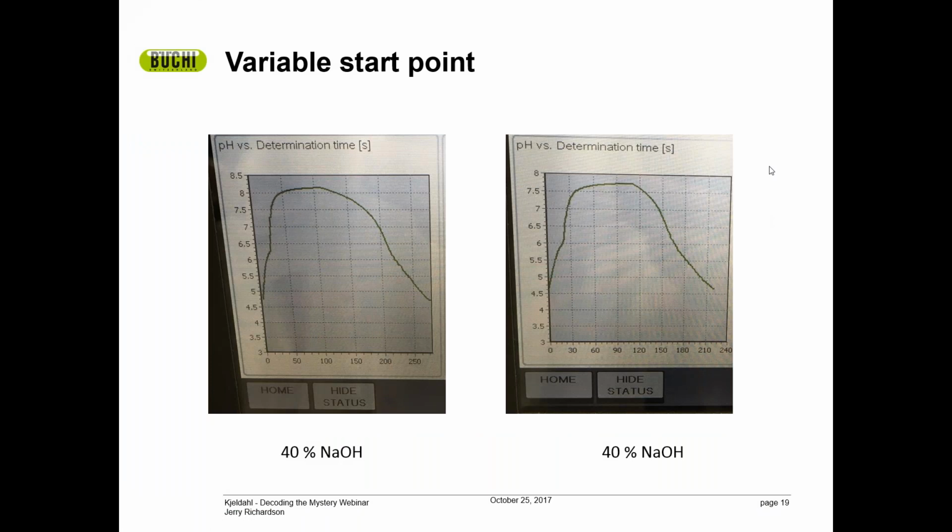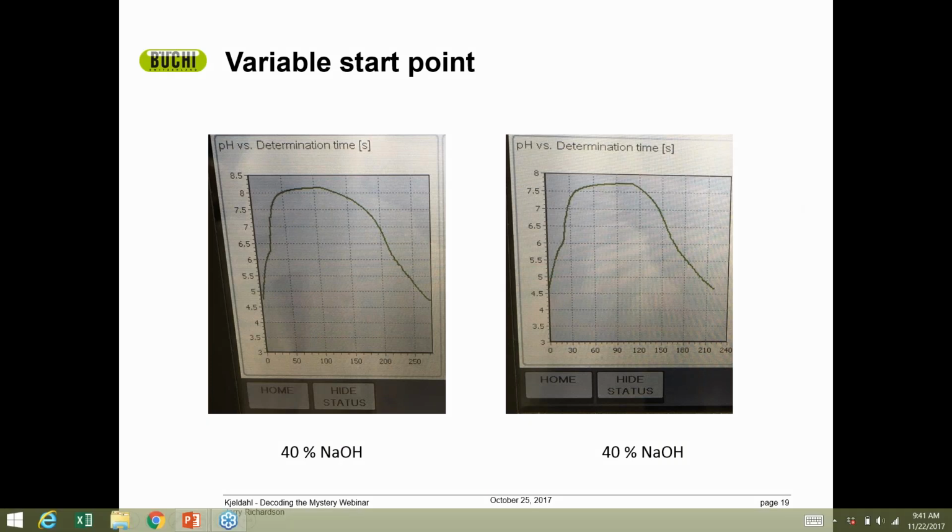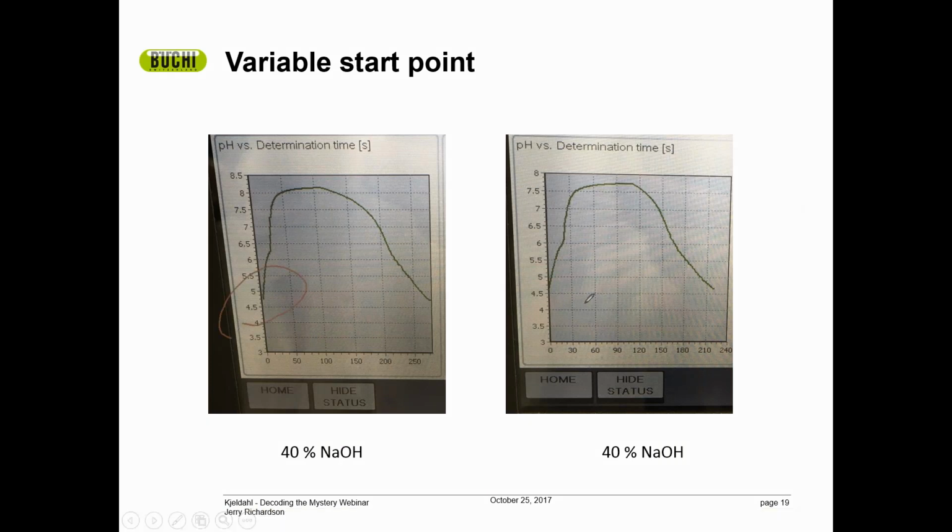Okay, to add a little more to that, on this next slide, and I really should have blown this up, that is a variable point. Even though it's a minor difference, it can add up to a big difference when you're talking about Kjeldahl in the world of protein, because many times the recoveries need to be between 99 and 102%.